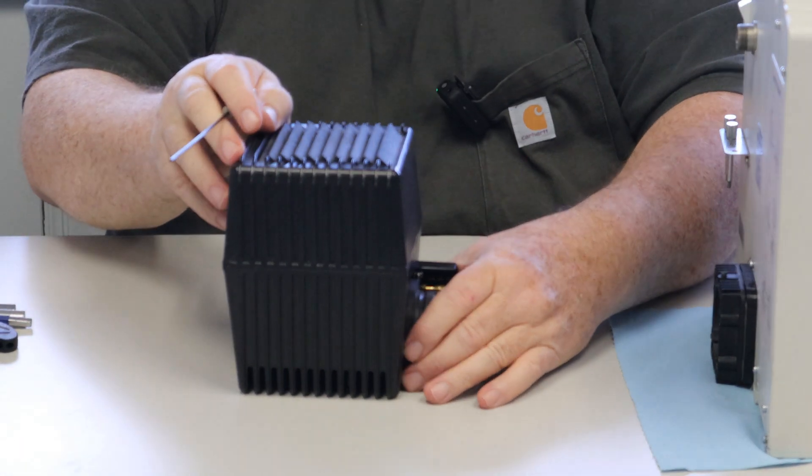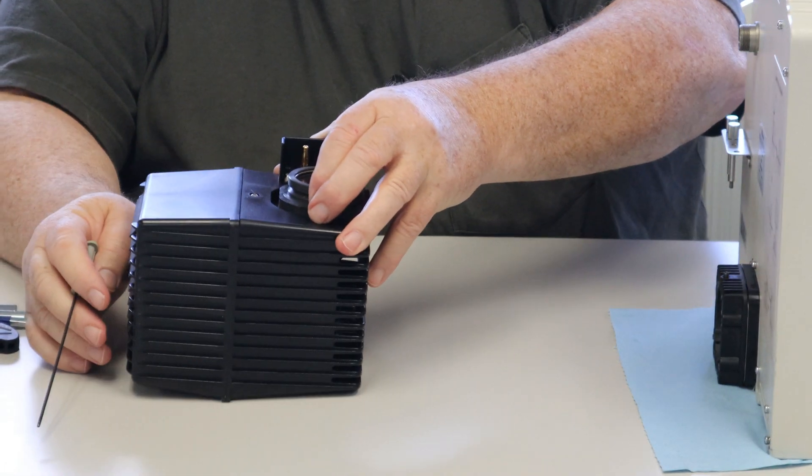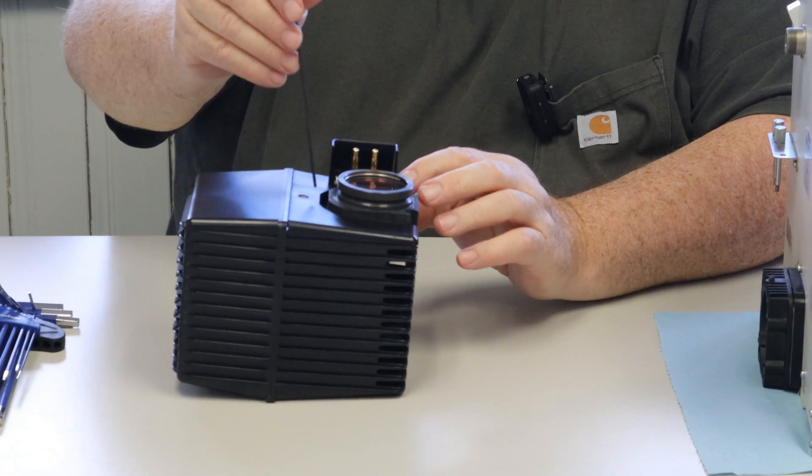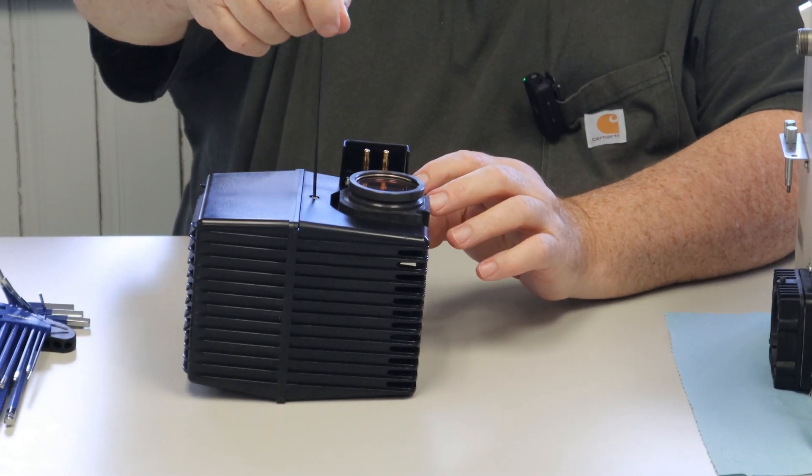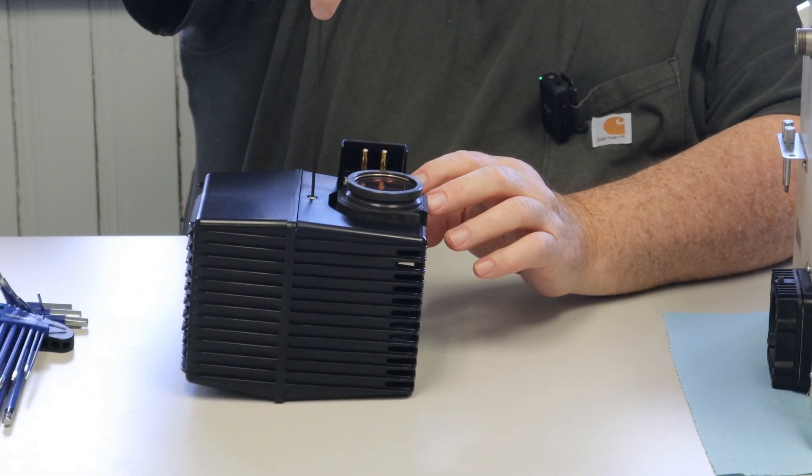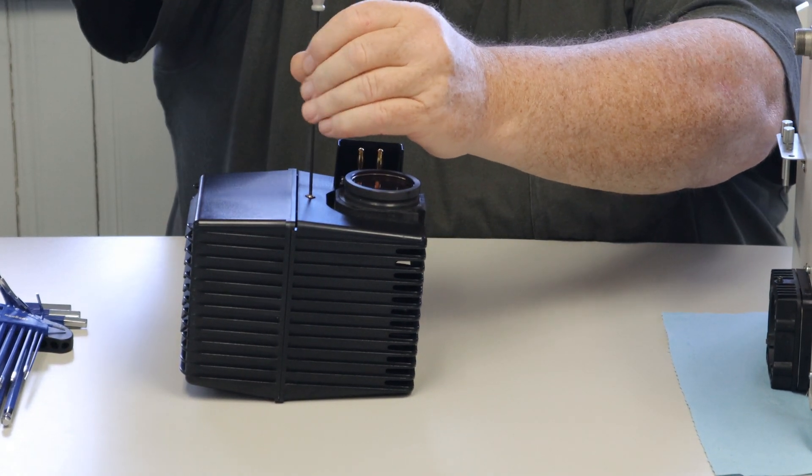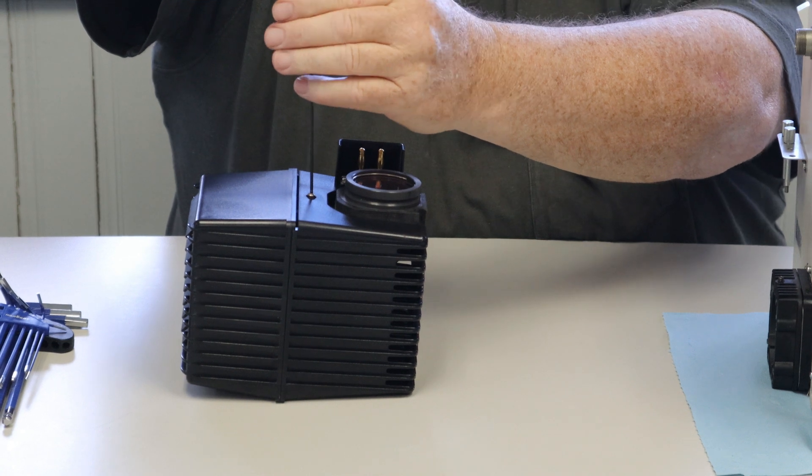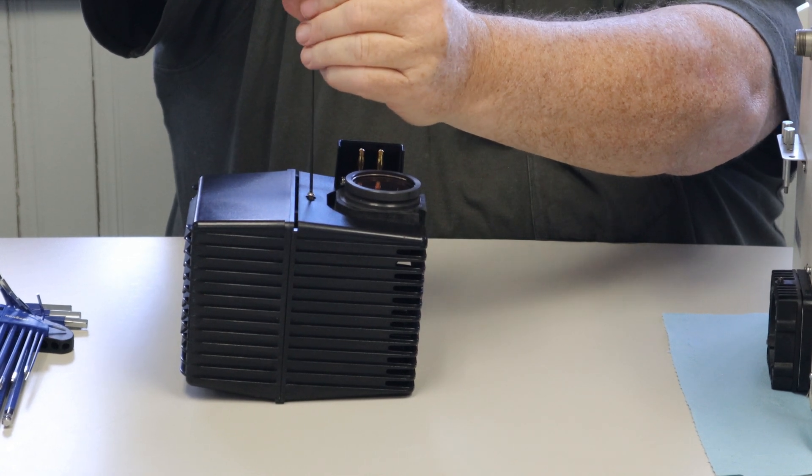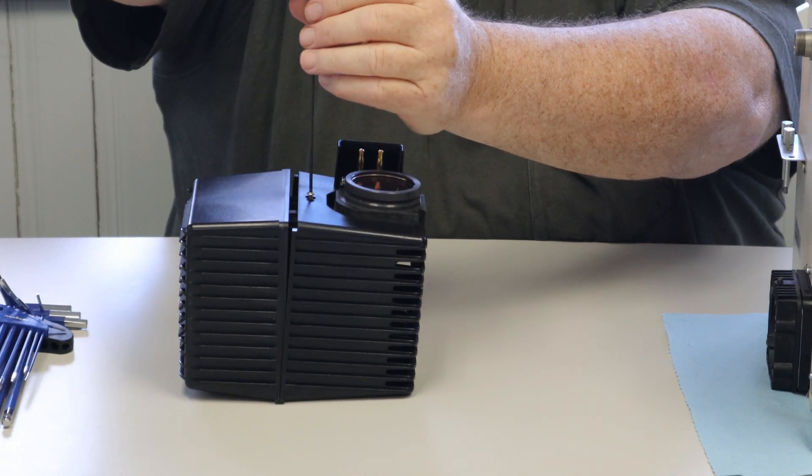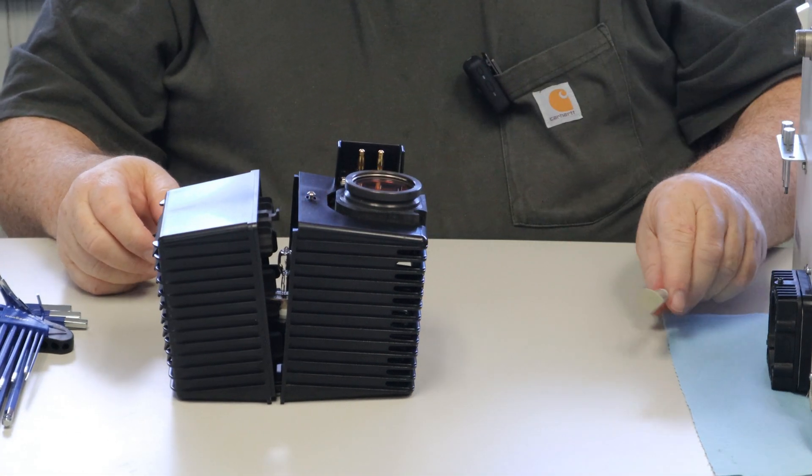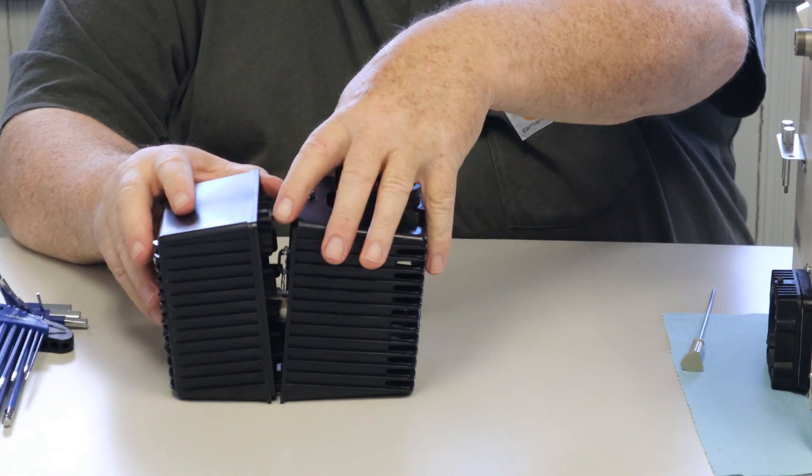Now using the same wrench, go to the front of the lamp housing and loosen the screw. Again, you don't have to take the screw all the way out. It has a lock washer on the other side to make that very hard to do. You can see how the lamp housing just falls apart like that.